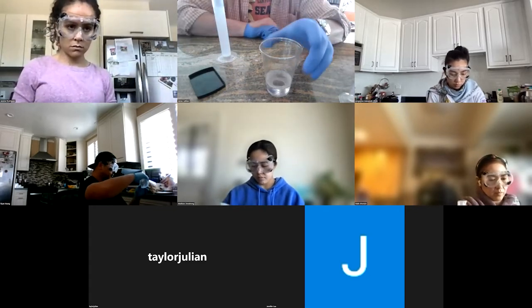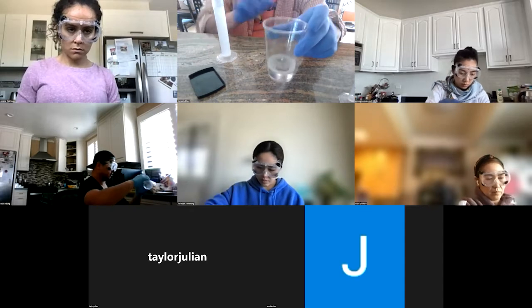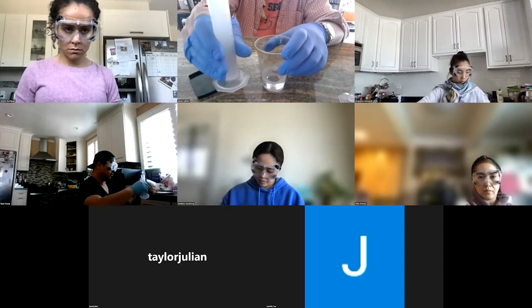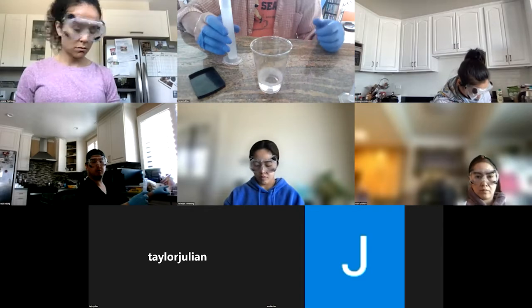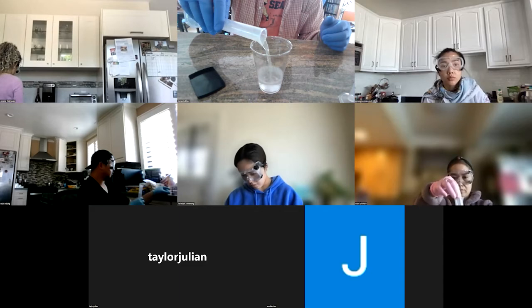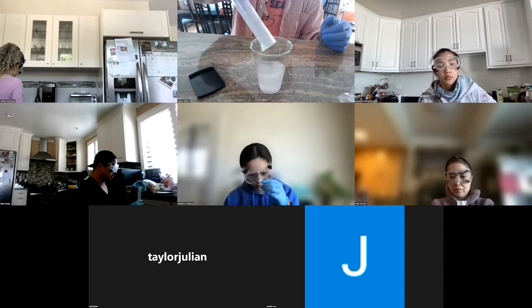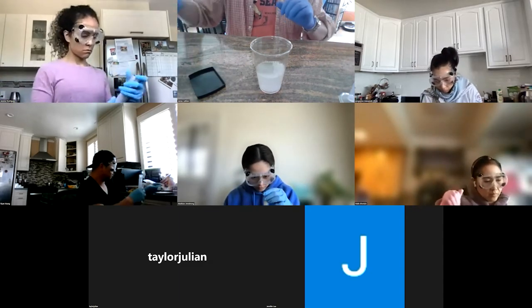What you're going to want to do is take half of this, 25 mils, and mix it with 25 mils of this, okay? And stir this up.